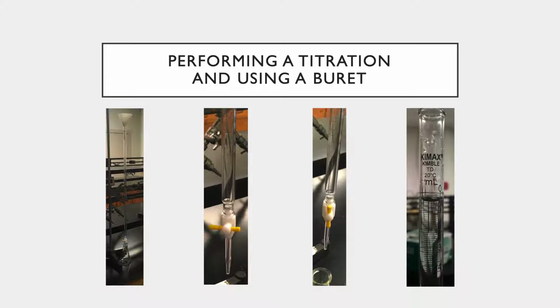And so remember when you do read your burettes, for instance, if you're reading the burette that's here in this image on the right, since all these tick marks are basically 1/10 of a milliliter, you do want to give a second decimal place. Right? So for this one, it looks like 1, 2, 3, it's maybe just past the 4th tick mark, so maybe like 0.42 milliliters or something in that range. If you think it's exactly on that line, say 0.40 milliliters is your initial burette volume.